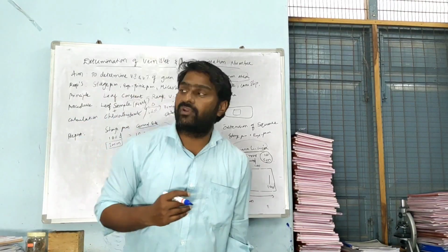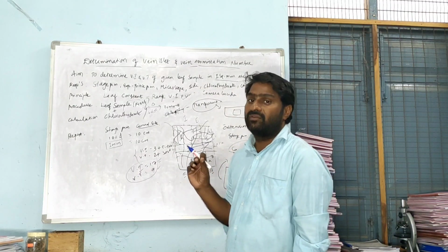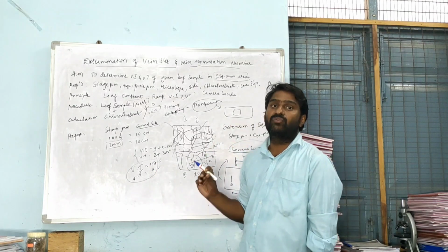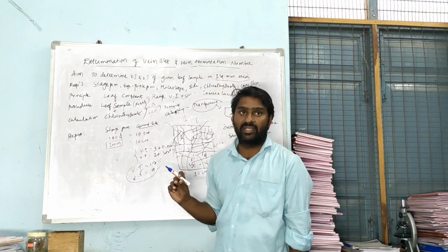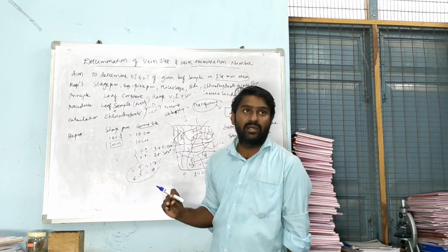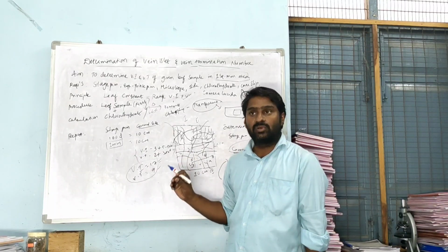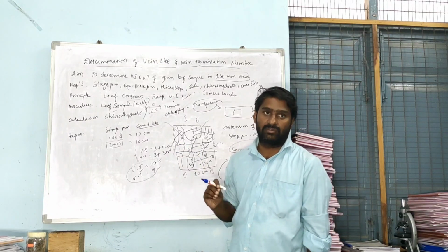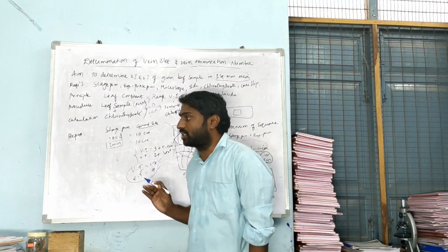Coming to the report, when you are writing a report, you should report in such a way that the given leaf sample is determined for its leaf constant as vein islets: the number of vein islets and number of vein terminates in a square millimeter area are dash and dash. So the given leaf sample may be so and so. Then your report gets completed. So this would be your complete practical.